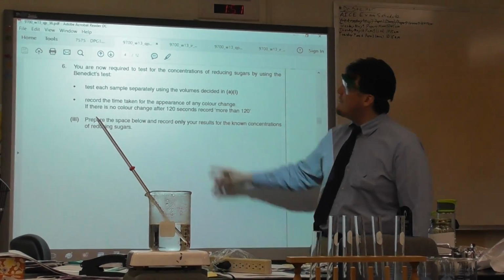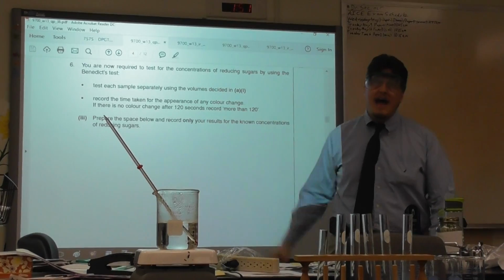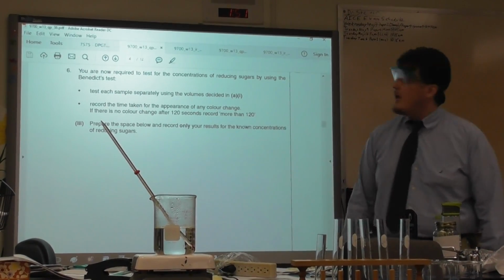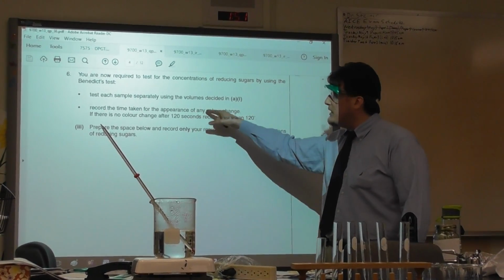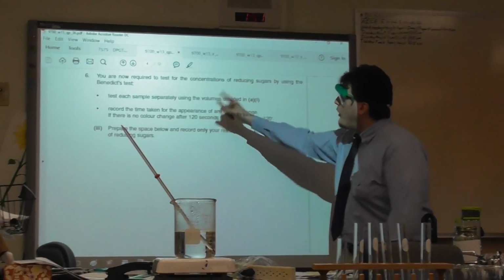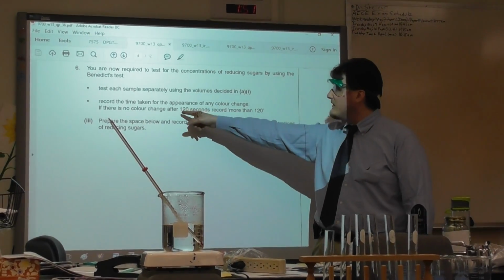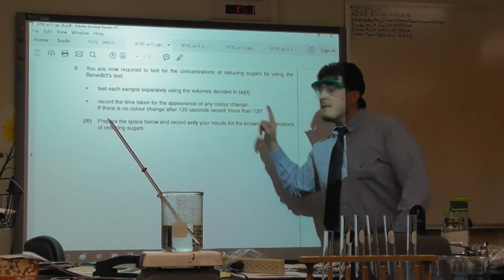And I'm going to have seconds, time taken in seconds. And I'm not going to have any units in my table. I'm going to have time for appearance of color change in seconds. And I'm going to have whole seconds only. And if it goes more than 2 minutes, which is 120 seconds, I'm going to write more than 120.